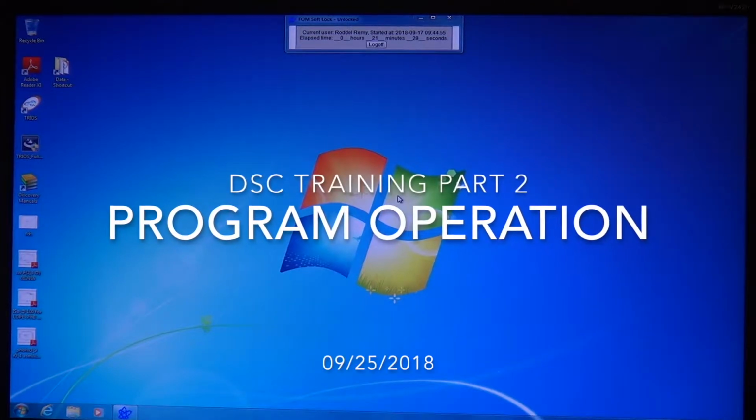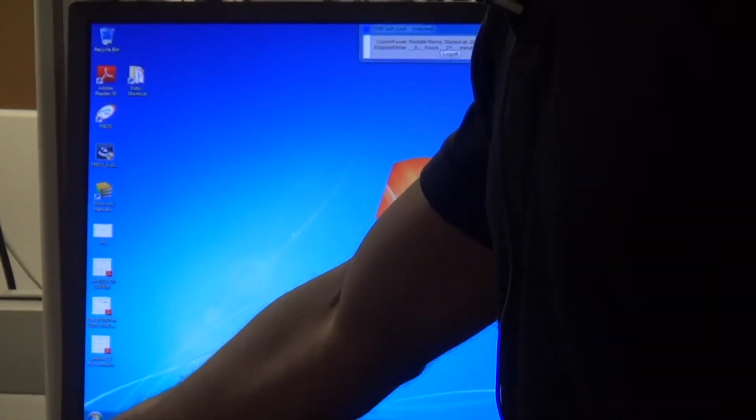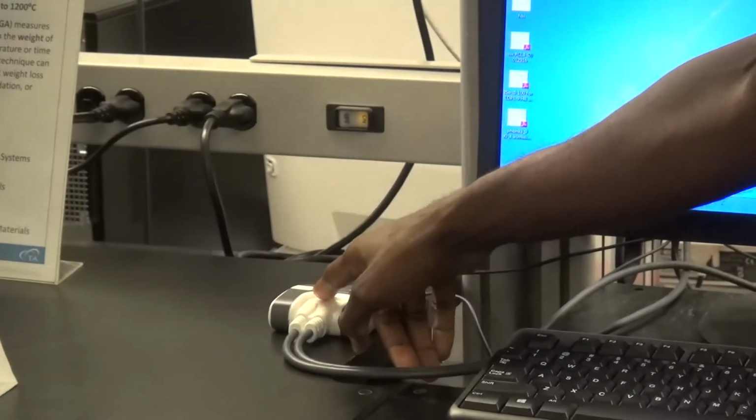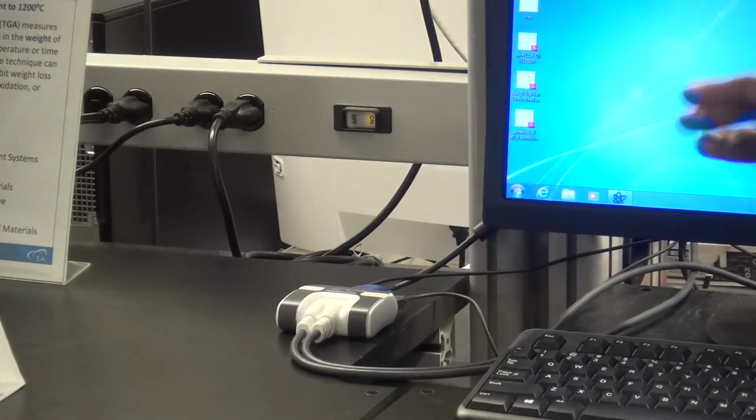is the DSC computer, and the bottom computer is a TGA computer. How do you know which one you're operating? It's by this little switch over here. If the green light says DSC, that's the one that you're operating. If it says TGA, that's the computer that you're looking at.